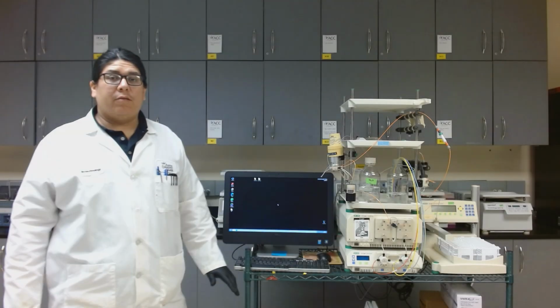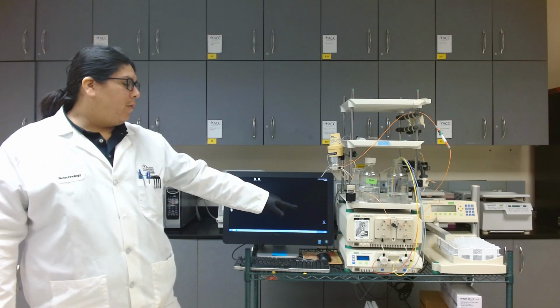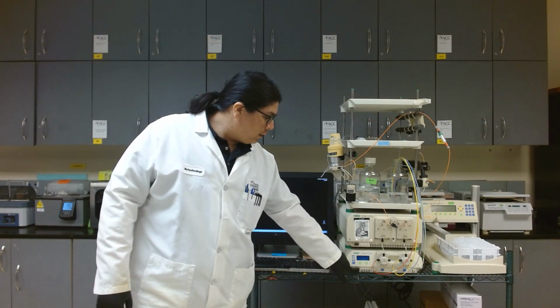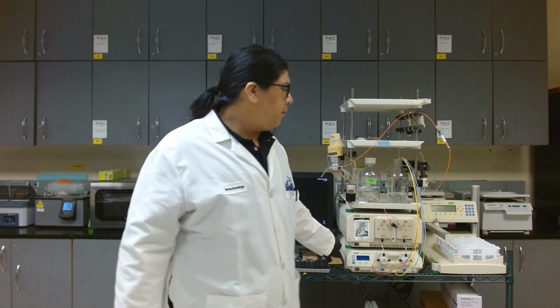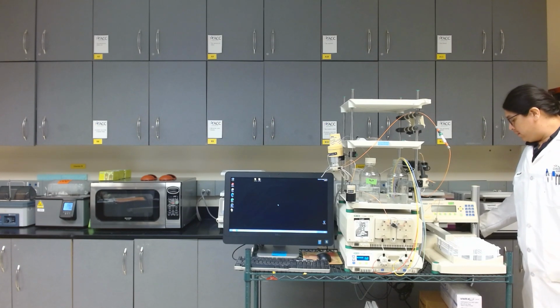So the first thing we're going to review is how to turn on the system. So I've got the computer turned on here, but before you open the software, I want to power on all of the individual modules. So I'll power those on, and then I'll walk through and give you an overview of what each of them are. There's 2 hard switches here. This is the pump and the maximizer. These 2 work in concert with one another. And this is our fraction collector. The switch is in the back.